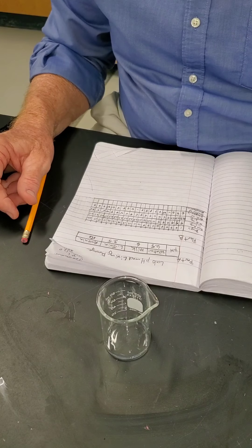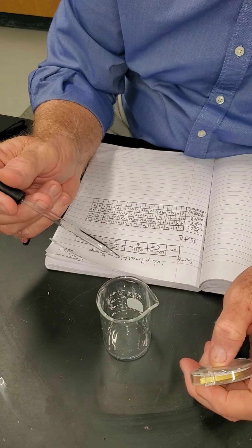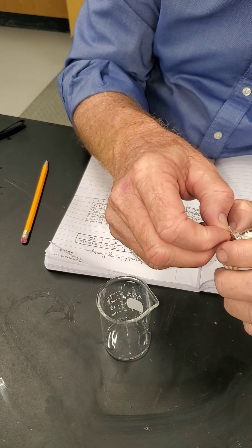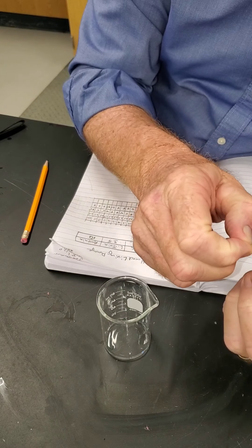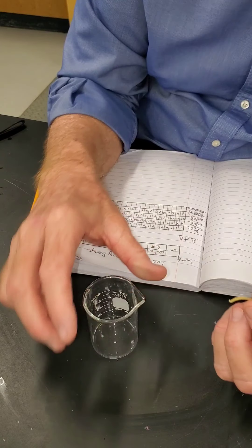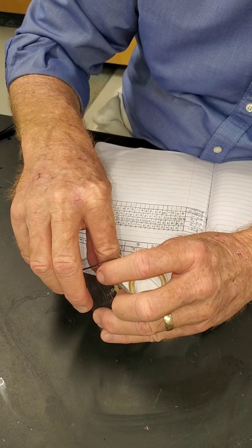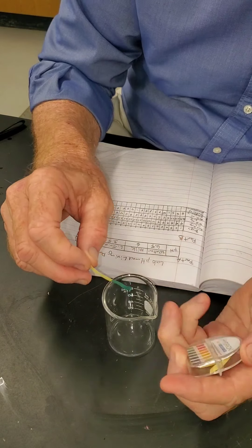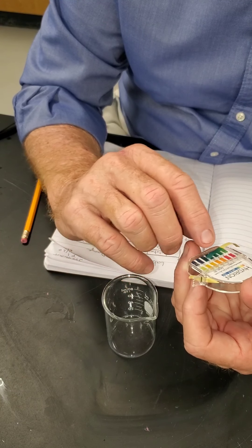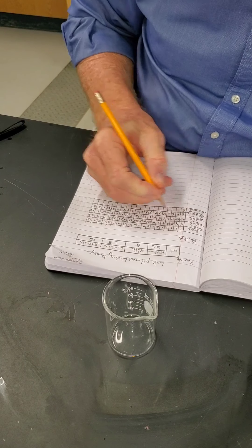We're going to add ammonia one drop at a time. The water, remember, was at 6.5. We swirl the water around — this is drop number one. We check the pH and the water went from 6.5 up to 8, just like that, on the very first drop.